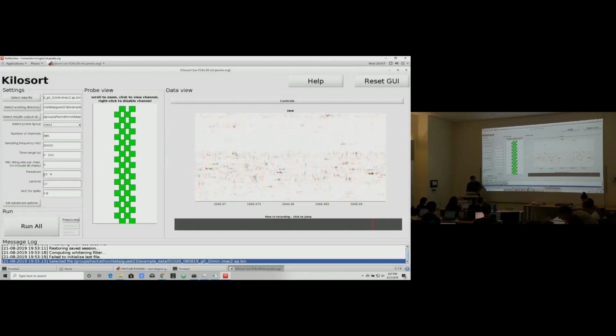All right, so I've already told you about these, so let's just leave them. We'll modify them only if we need to. There's also a way to see advanced options, which is to just type them into the keyboard. But again, nothing there is going to super change the results of the algorithm. There's no magical parameter you might be able to set. There are relatively few parameters, so if something isn't working, we might have to dig in a little bit deeper and see if we can add some extra pre-processing or post-processing of the data, to make it work for the very variable data sets you all have.